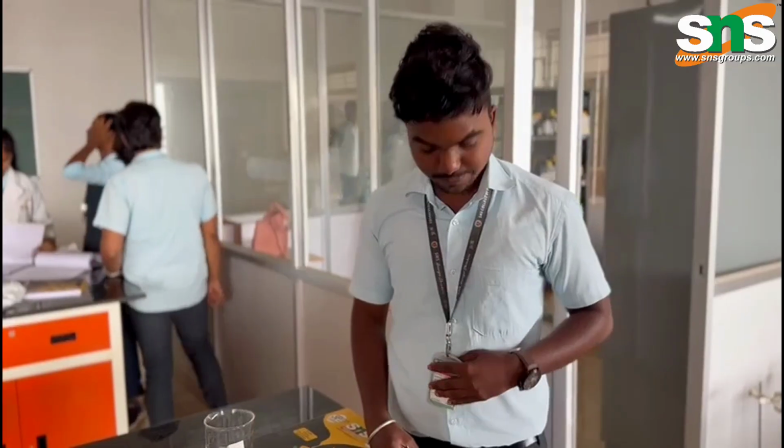Okay, now a quick question. Which one checks water cloudiness? Nephelometer. Correct. Which instrument is used to purify water?